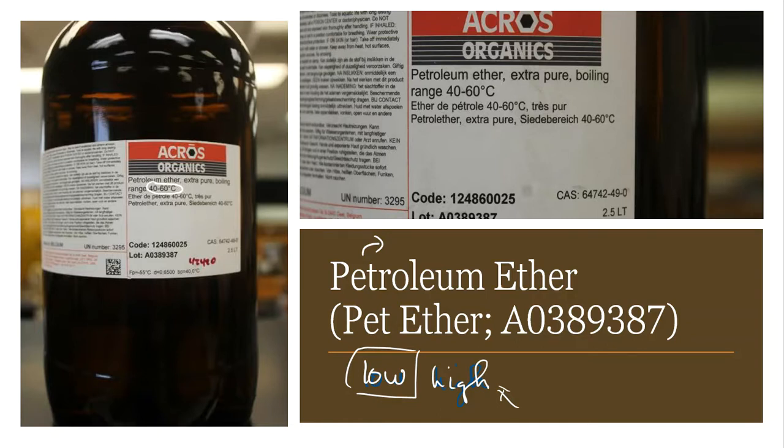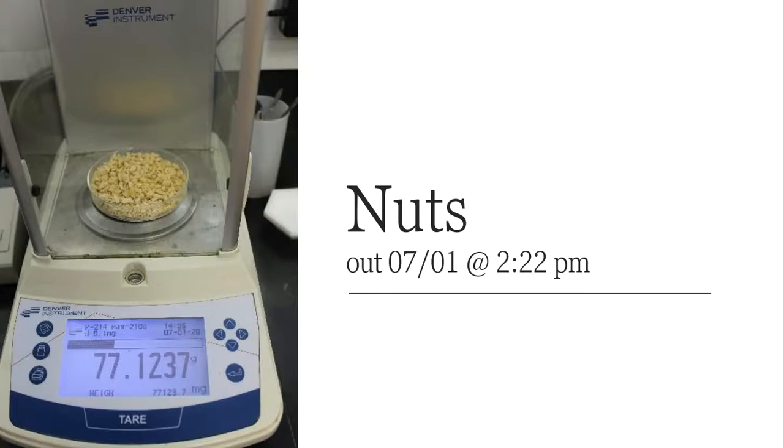All right, so now that I've got my petroleum ether, I come back on a different day, 7-1. I take the nuts out of the oven at 2:22 p.m., so you can time and date it. And the mass of the nuts and the petri dish is 77.1237. So keep in mind that mass is for both the nuts and the petri dish.